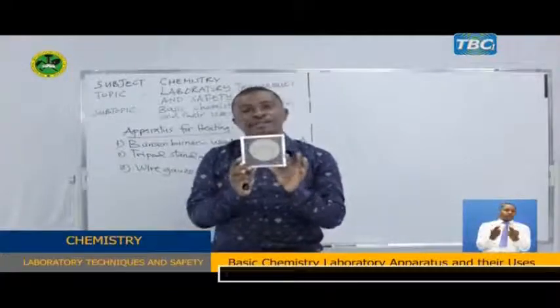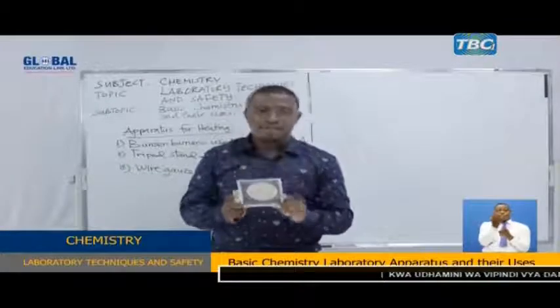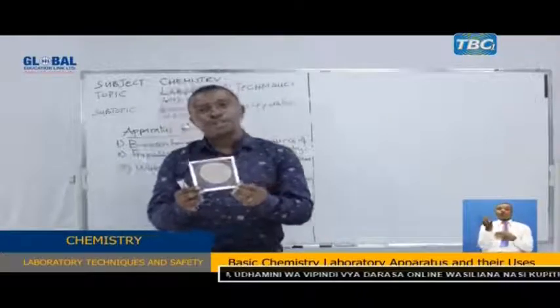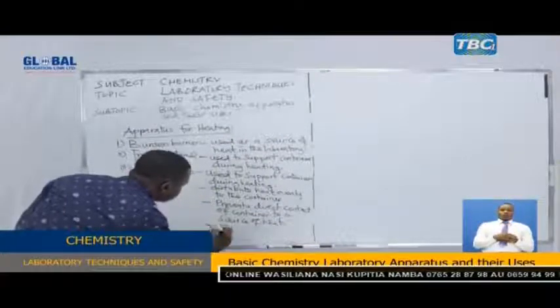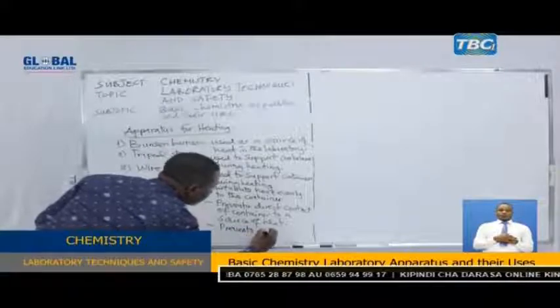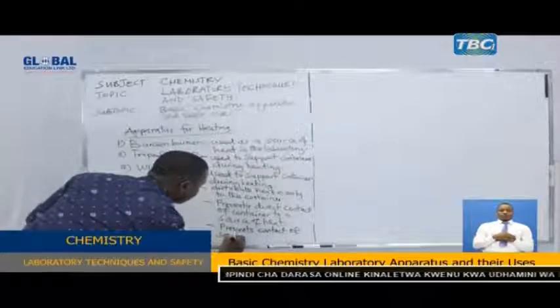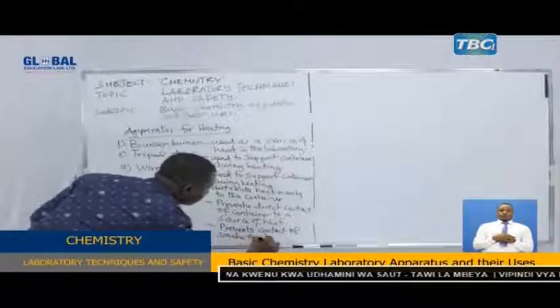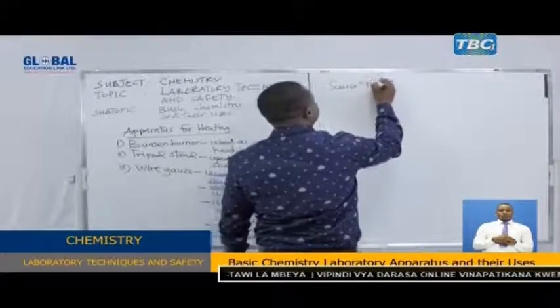So this one prevents direct contact of heat to the container. It also prevents smoke from the source of heat from reaching the container.